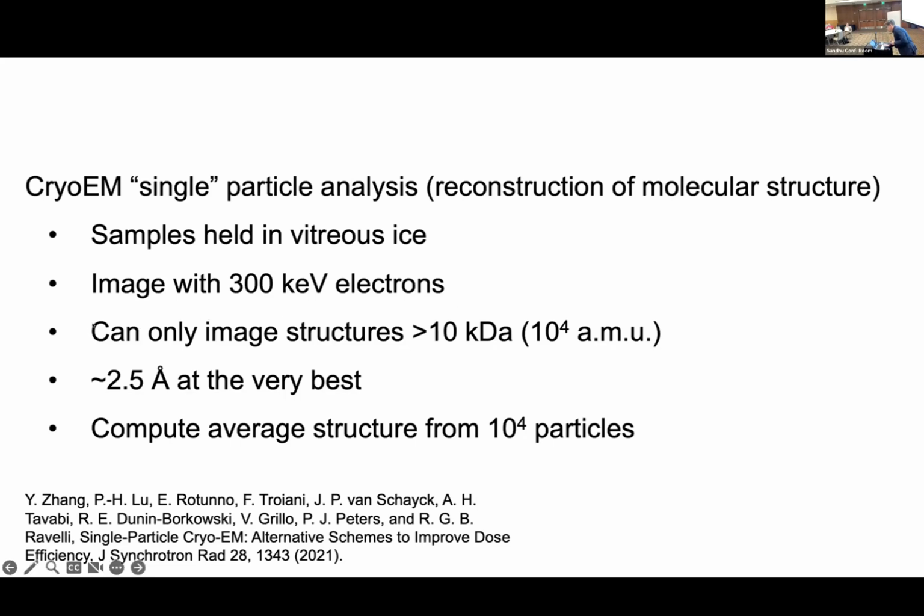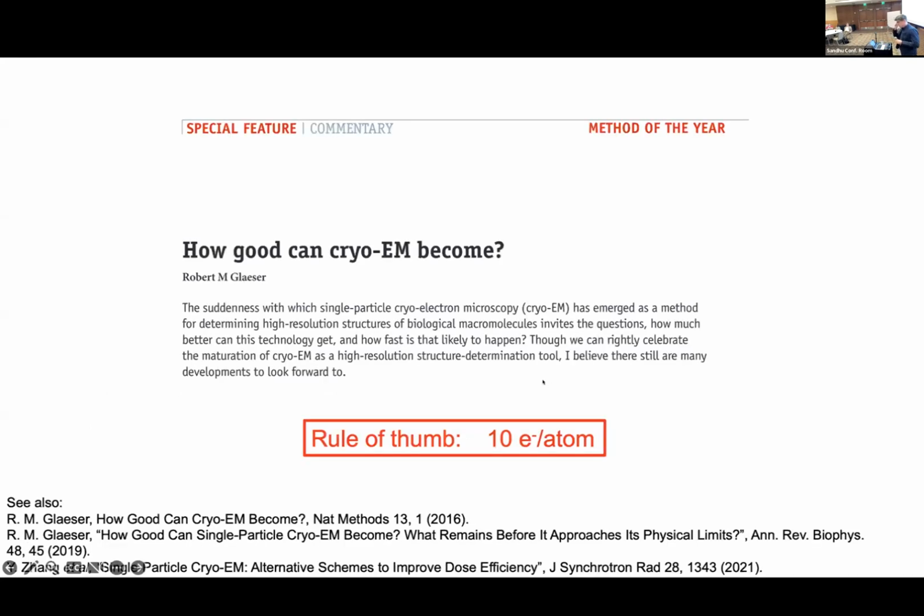And right now, the limiting resolution depends on who you ask. It's about 2 angstroms. Some people will claim a little bit less. So it's getting near atomic resolution, but there's lots of important things that you want to see that you just can't right now. Okay, so there's been a lot of papers on what the fundamental limits are.